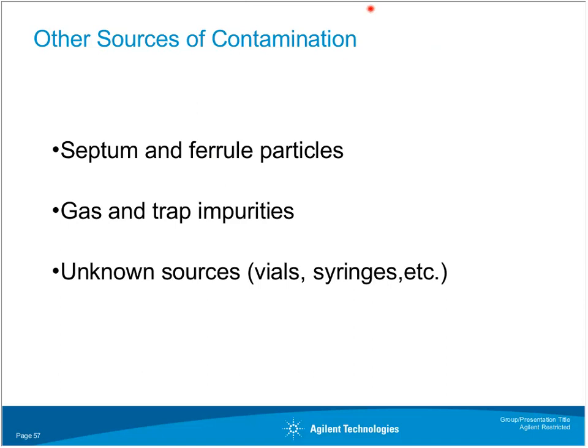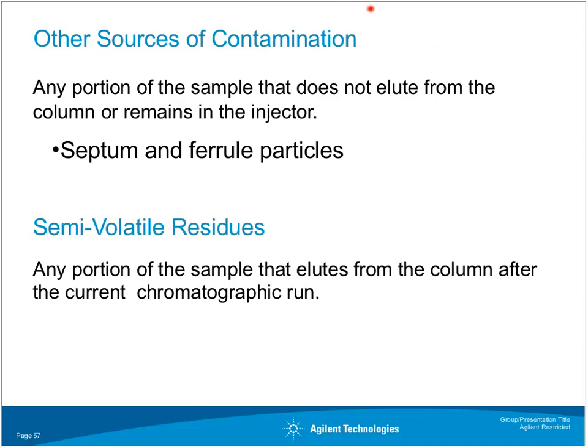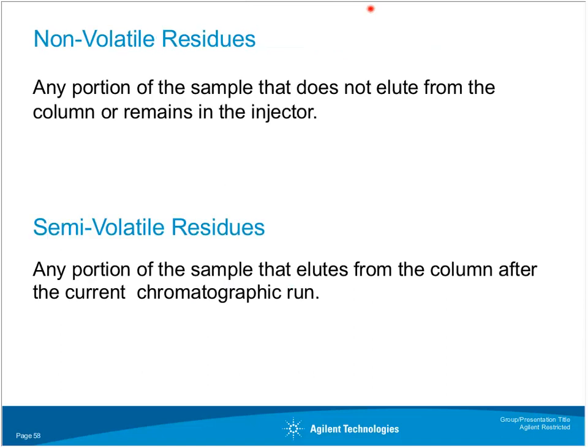So again, the one fun thing, so to speak, of gas chromatography is that there are so many things that can go wrong or create issues, and finding them can be really a trick. So again, being proactive about a lot of these things will at least ensure that you spend your time focusing in the right area, hopefully, if one of these issues does come about.